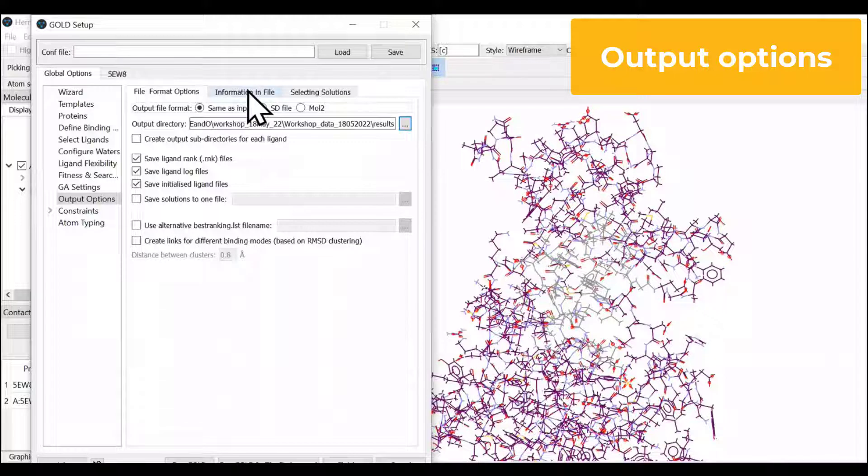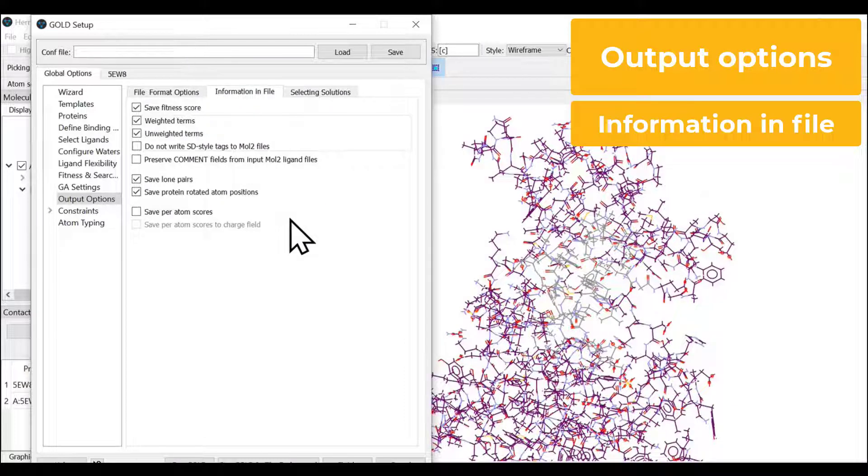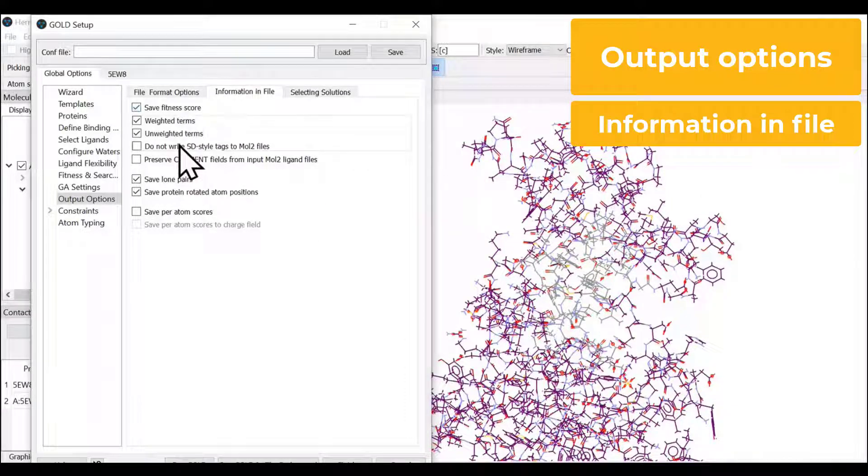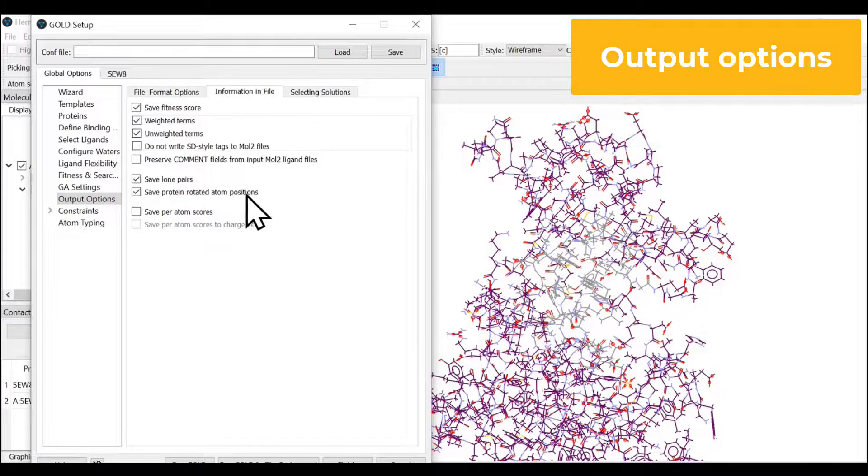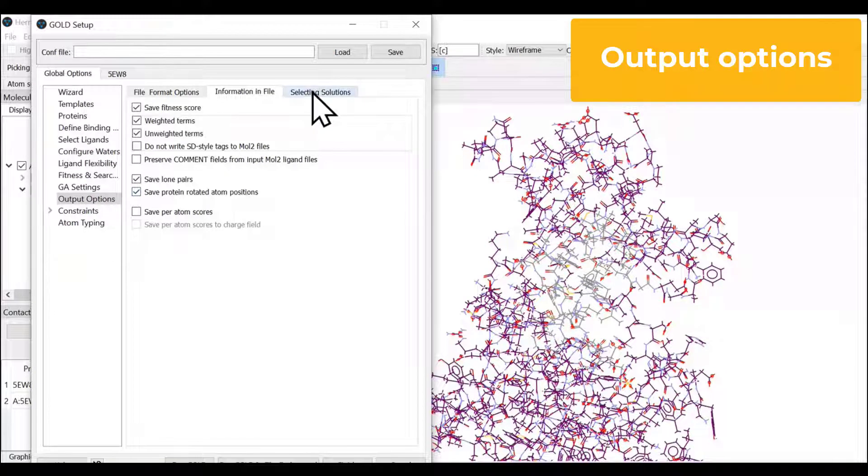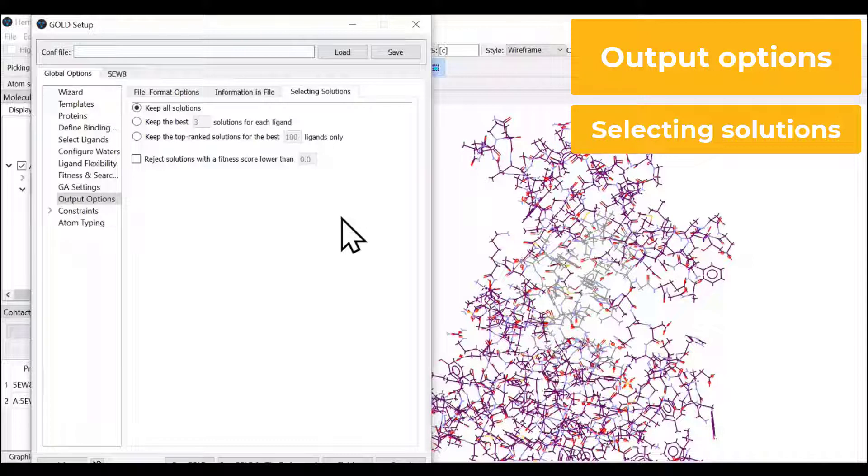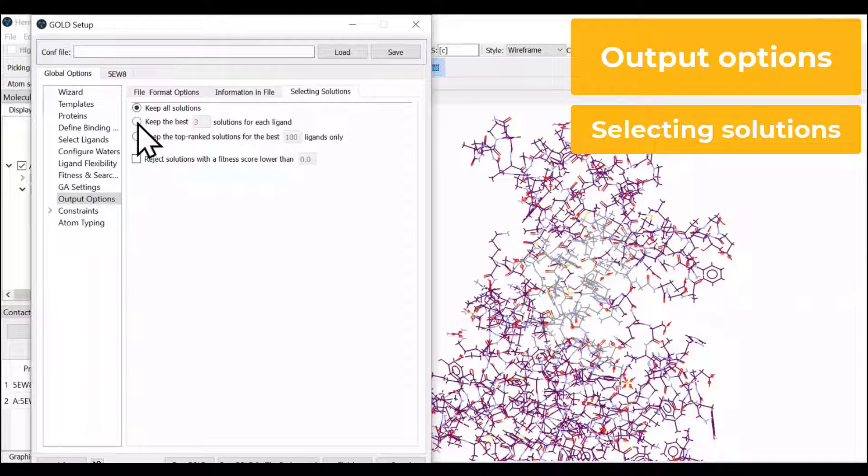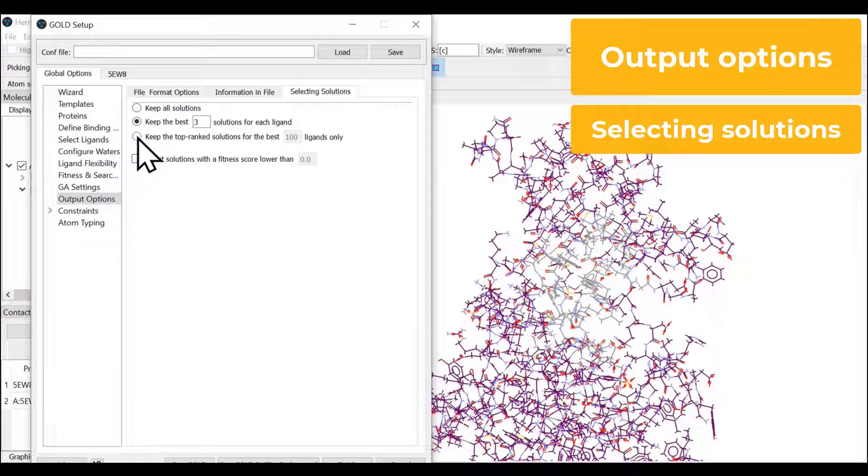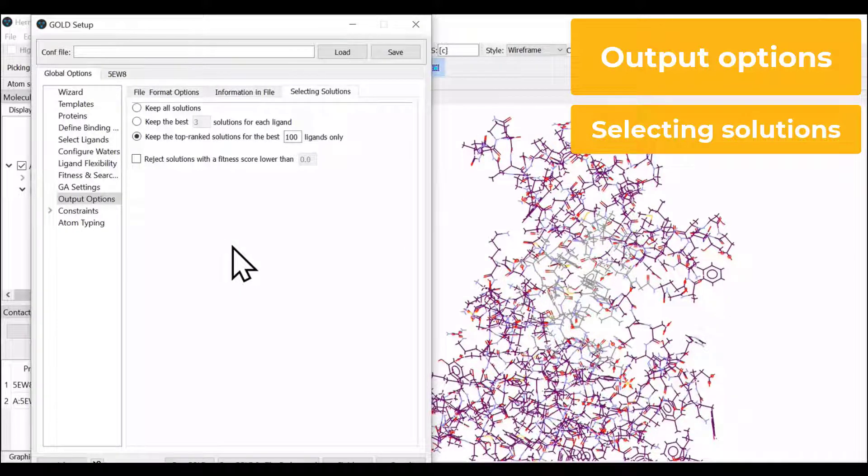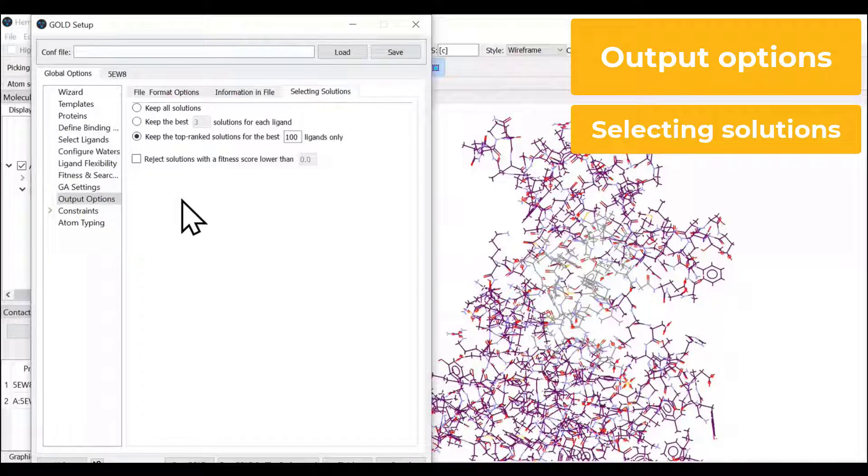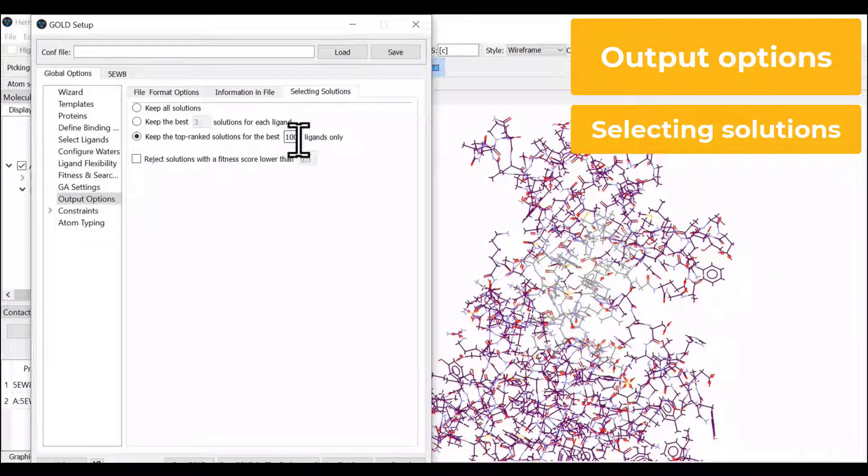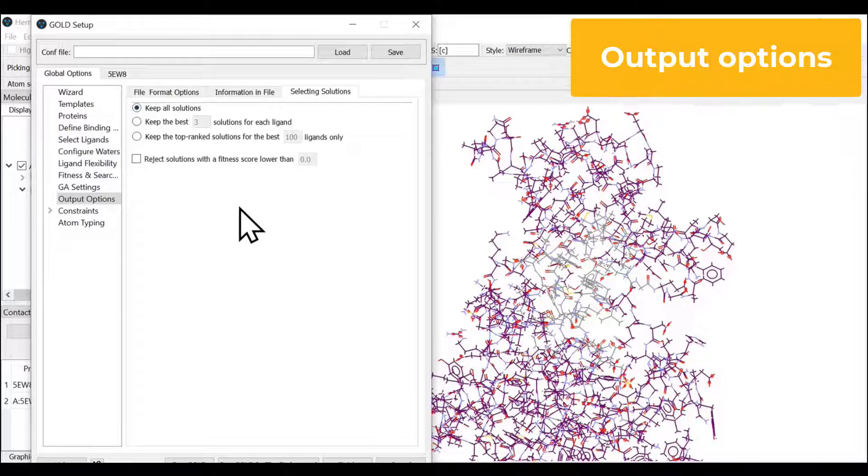In the information in file tab, you can select what you want to save from your calculation: fitness score, weighing terms, unweighing terms, and so on. In selecting solutions, this is where you decide if you want to keep all solutions or only top three best solutions for the ligand, or top rank solution from your set of ligands. If you have multiple ligands, you can mention ten, hundred, thousand as you wish. Let us keep all solutions since we have only one ligand.